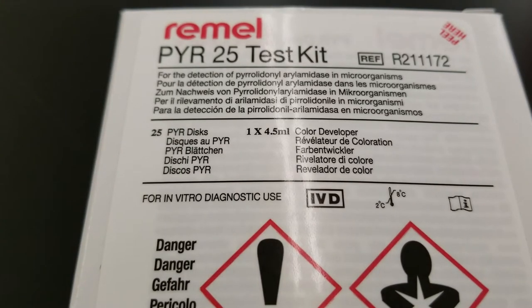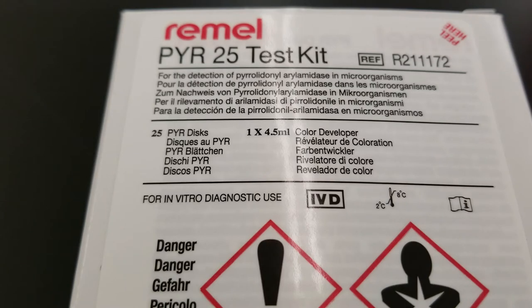Today we are doing the PYR test. We're expecting to do the PYR test when we have a catalase negative organism that is gram positive cocci in pairs and chains. So we're thinking either Streptococcus or Enterococcus out of our classroom organisms. The two that would be positive out of all the streps and Enterococcus that we have are any Enterococcus and then the Group A strep.